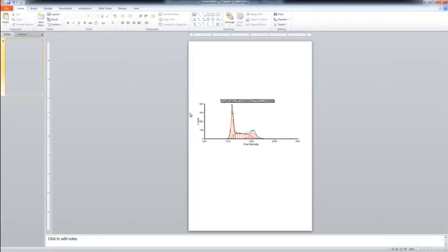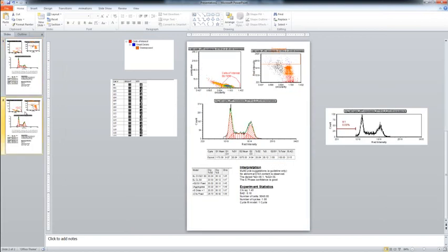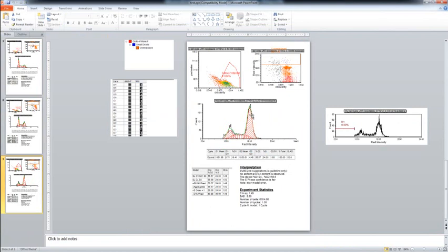It's going to quickly analyze all 3 of these data files. So here comes sample 1, and now you can see on page 2, here comes sample 2, and again on page 3, our third 50 nanomolar Nocodazole treated cell is appearing.